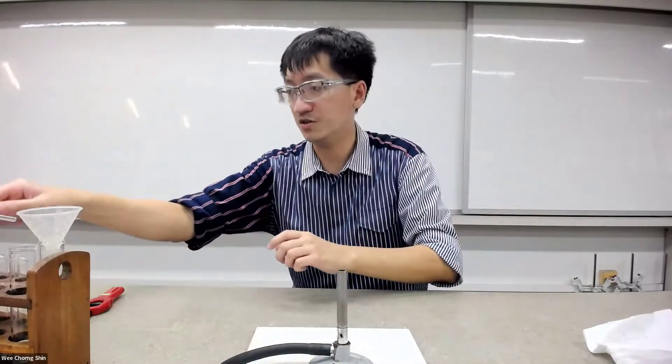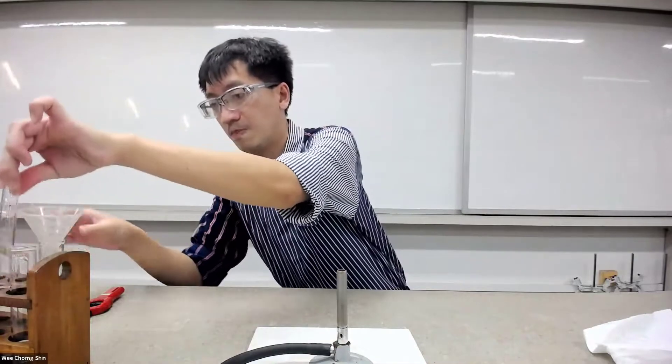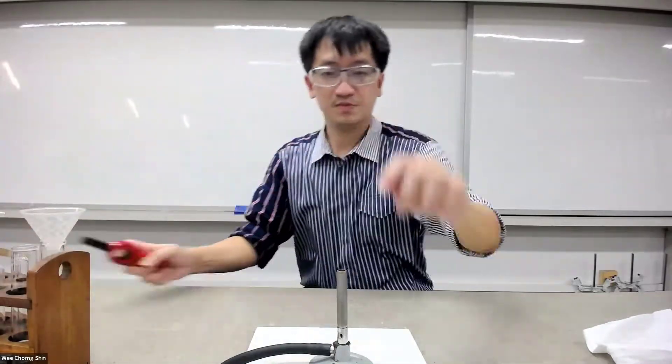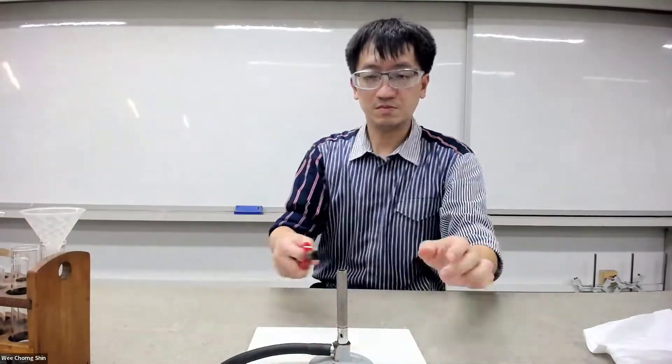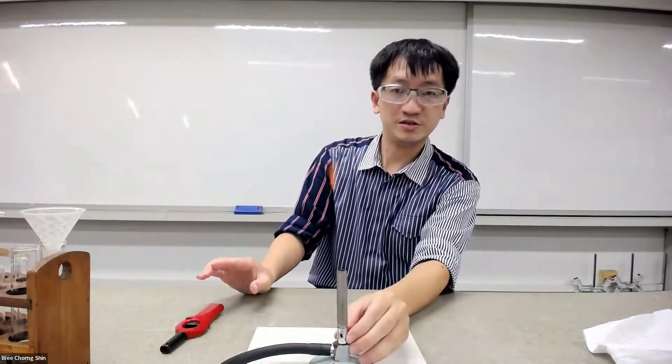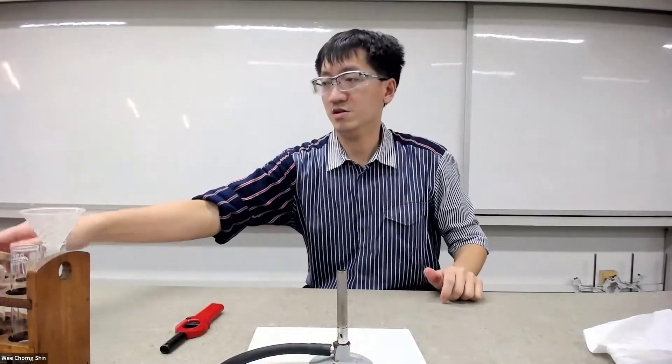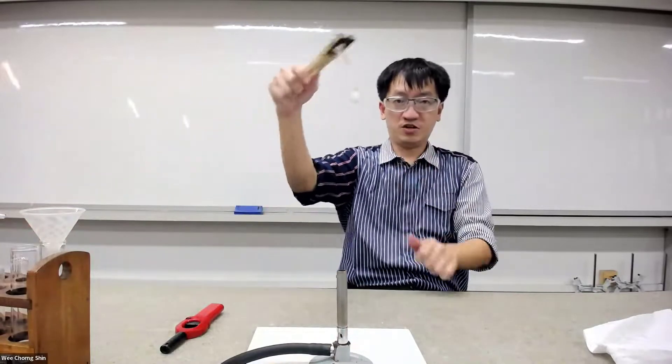Now I'm going to switch on the flame. Adjust it a little bit. Please take note of what you're going to observe.